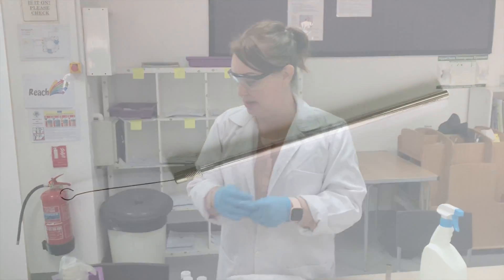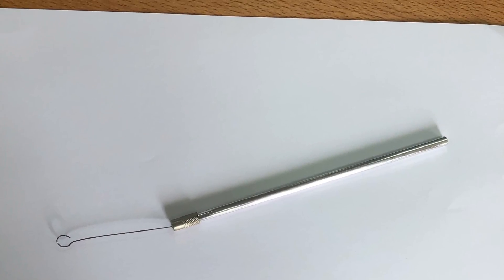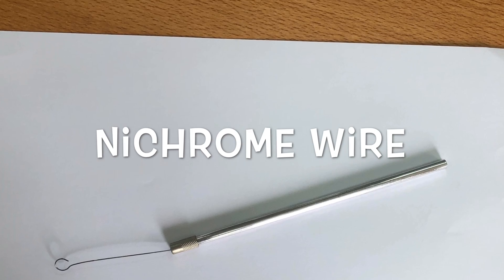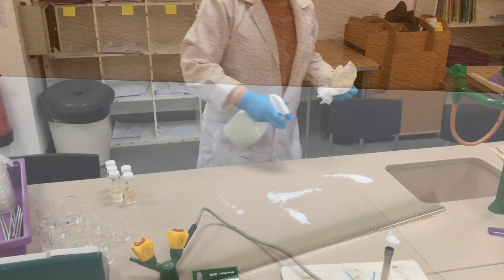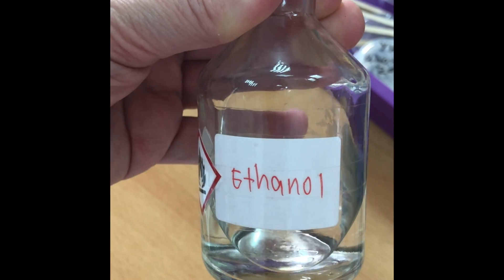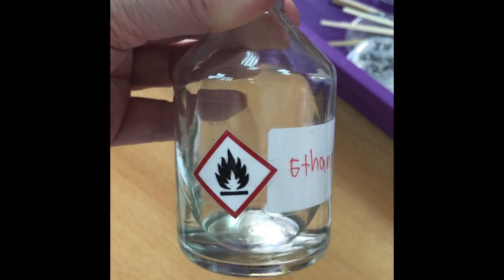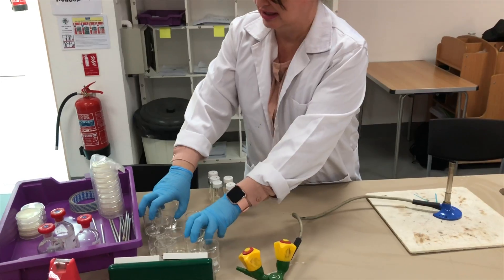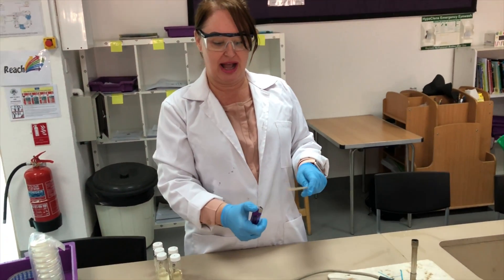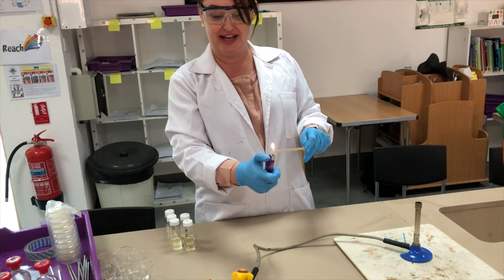You'll use a nichrome wire to inoculate your agar plate. Nichrome wire is used because it heats up very quickly — you'll see it glow red in the Bunsen burner flame — but it also cools down very quickly. To prevent cross-contamination, wash your area, wash your hands, and wear some gloves. Remember the ethanol is highly flammable, so keep it to one side out of range of the Bunsen burner flame. Then light your Bunsen burner.